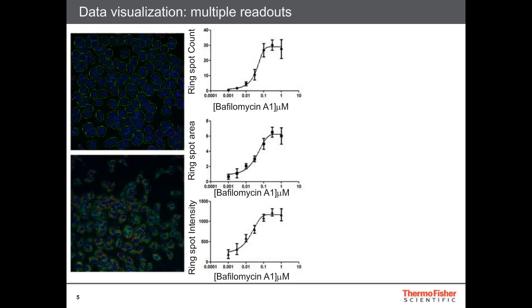And these aren't criteria that we pre-selected. This all comes through automatically, and so you're actually able to mine your data sets, look for novel changing parameters. It's a very useful tool to interrogate novel biology. So what we're doing here, we have replicates of 6 with 7 concentrations of the drug. We're plotting the means from each well. This is a very nice way of getting reproducible and robust data.